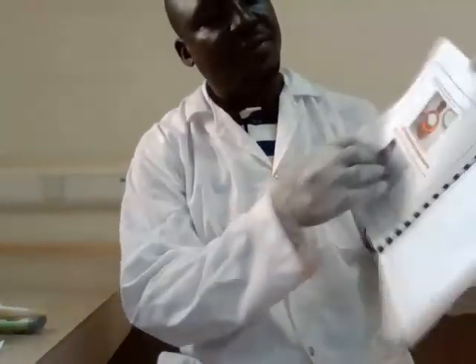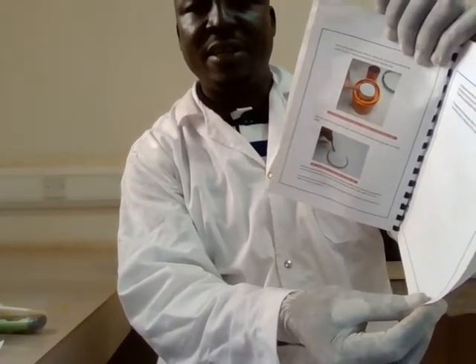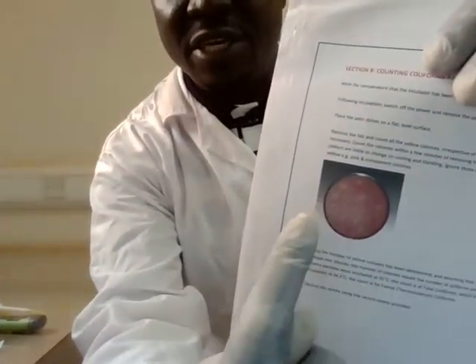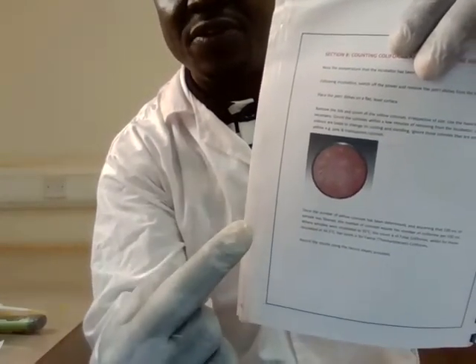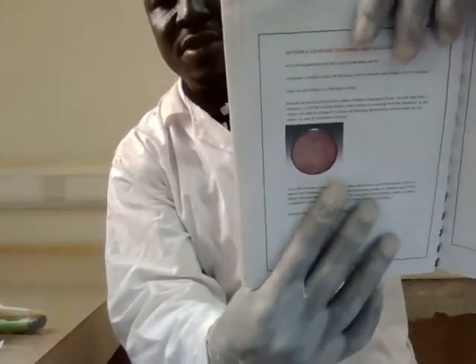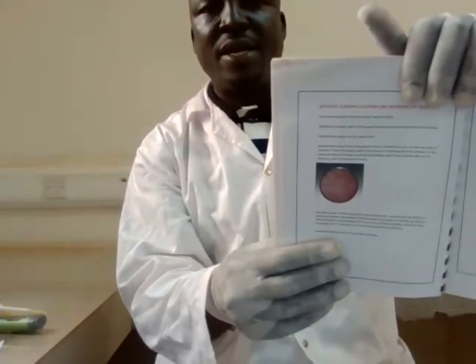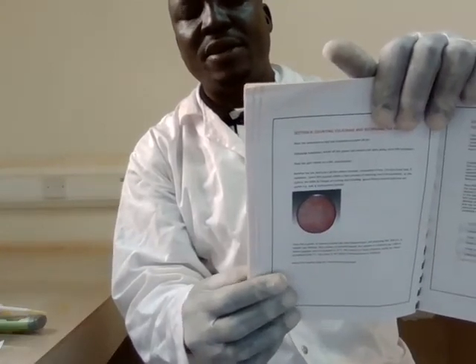Okay, this is just showing you how you assemble the equipment and how you do membrane filtration, and then how you can place the filtered sample on the petri dish. And then these are the colonies I'm talking about. You see there, this yellow dotted thing, these are the colonies, and these are the ones you count. And then there are also the red ones. According to this media, any yellow colonies that you see there is E. coli, Escherichia coli, and the red ones are considered to be other coliforms.